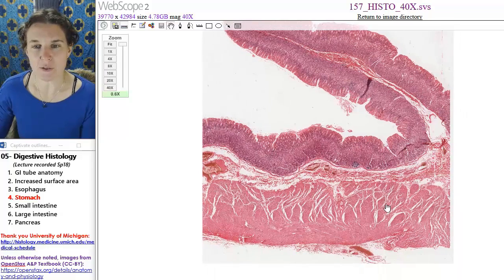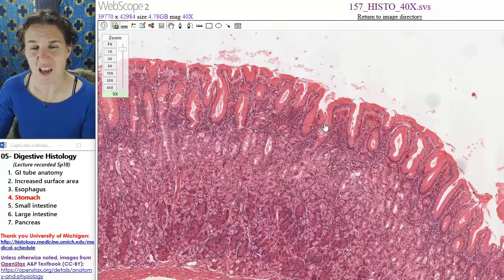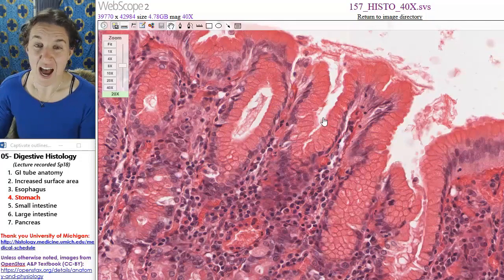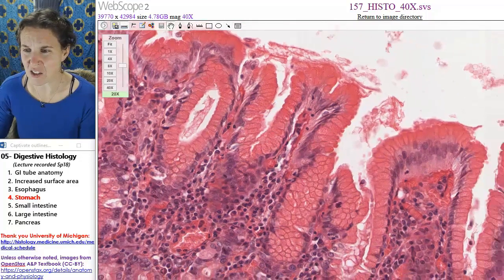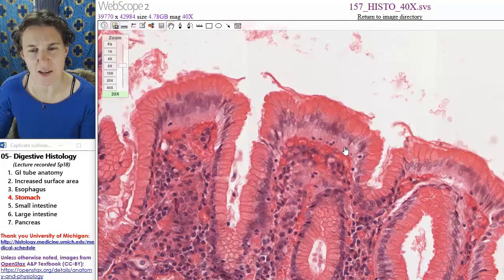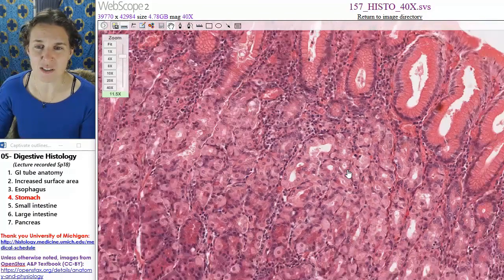Now check this out. Can you see sort of blocky, like these are probably my rugae, these blocky chunks of tissue, and if we zoom in here, you will be able to see, oh, good graciousness. I think the slices look kind of, oh, here's a good one. Here's a place where you can get a sense that, oh, yeah, it looks like simple columnar epithelium, which means that all of this is lamina propria. If you go deep, I'm going to zoom out just a little bit.